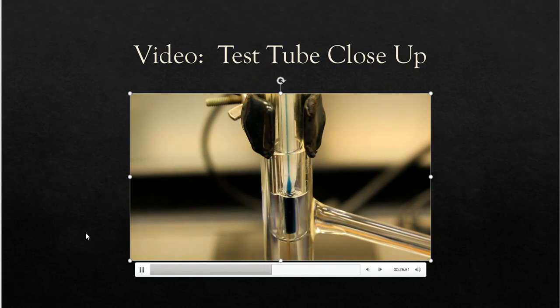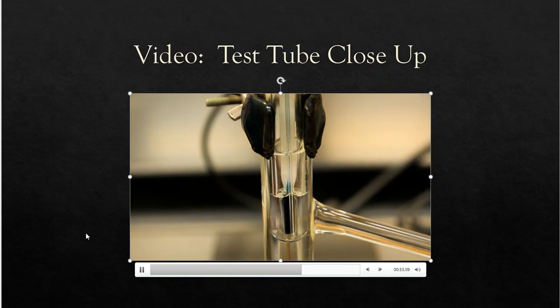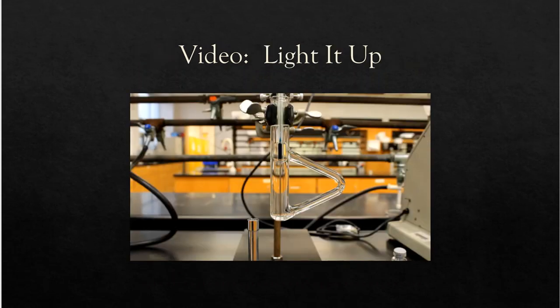When those bubbles happen, I take the heat away and I watch for the last bubble. And then this thermometer will provide me the temperature at which that last bubble has happened. And that is my boiling point, folks. So something as simple as this, just the Bunsen burner, and that's it. Anybody can do it, even your granny. Okay, so once again, a very simple test, just like density, just like refractive index, not a problem here. And it's bubbles. Bubbles are where it's at.